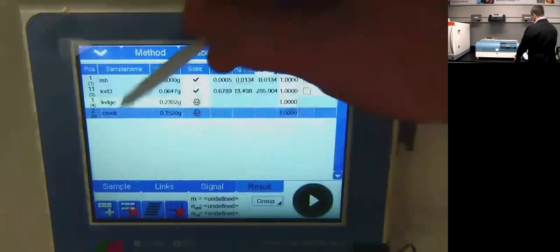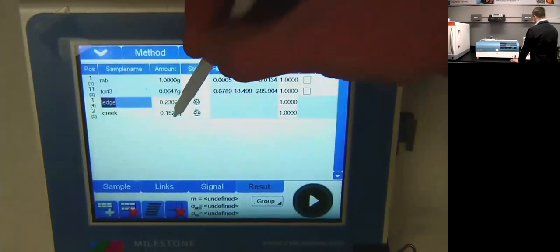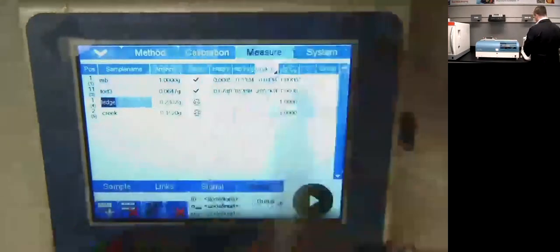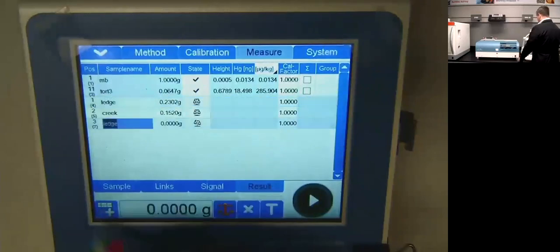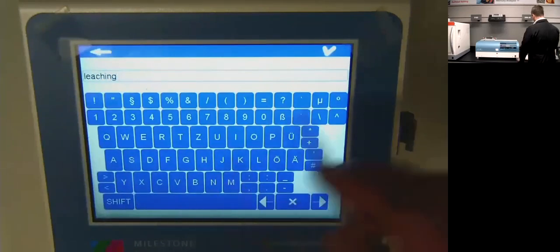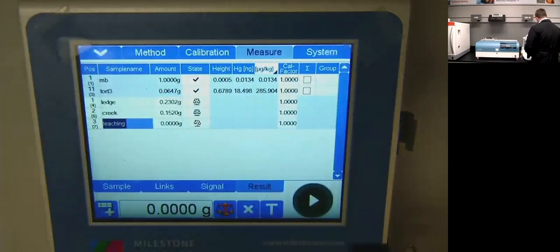I've already preloaded my first two samples. This is the ledge sample — number three on the diagram — weighed out at 230 milligrams. I did the creek at 152 milligrams, and now I'm going to add my septic leaching field soil. To add a sample, I hit this plus button and double-click. I'll call it 'leaching.' You can see the DMA is integrated with the scale. I'll place a quartz sample boat onto the scale, tear it out, and weigh about 100 milligrams of my sample.